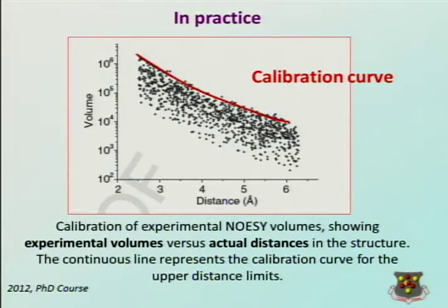This you can do manually or you can do automatically. That depends on the software you are using. Some software will do the calibration automatically if you say that your reference distance is a given value. Some other software will allow you to actually play with the curve.